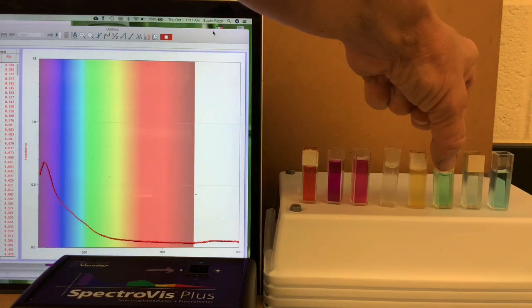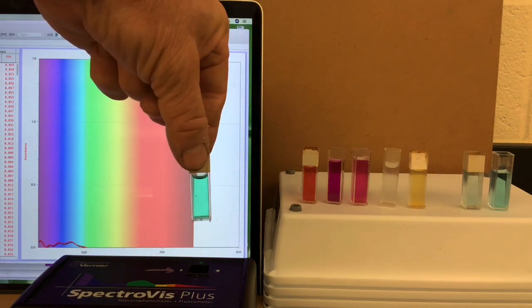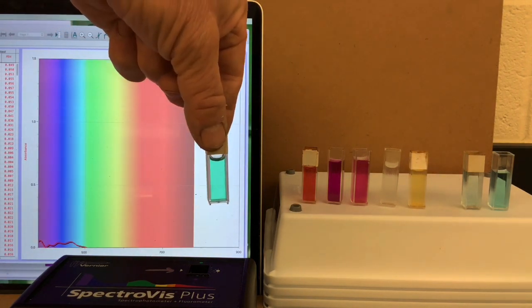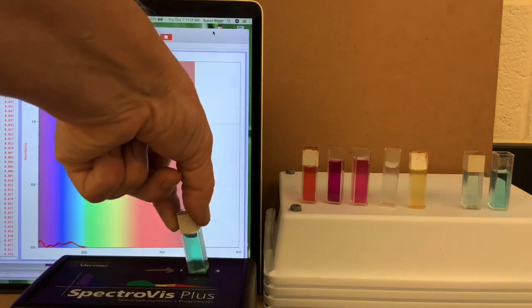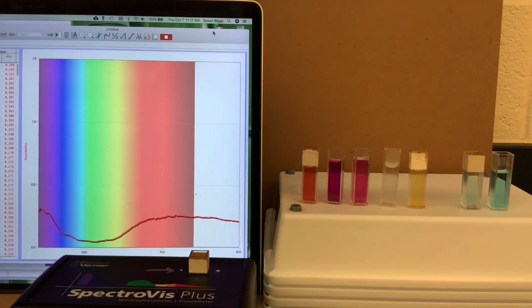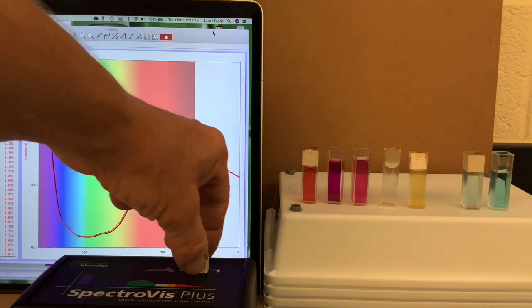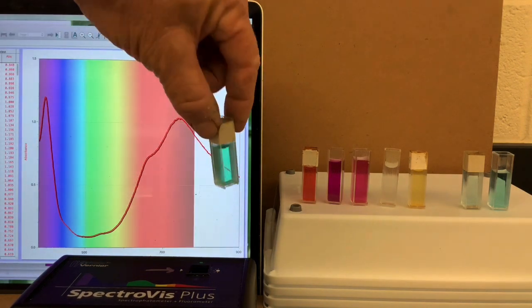And now, nickel, which is a green solution. And interestingly, it has two peaks. One in the purple range, one in the red range.